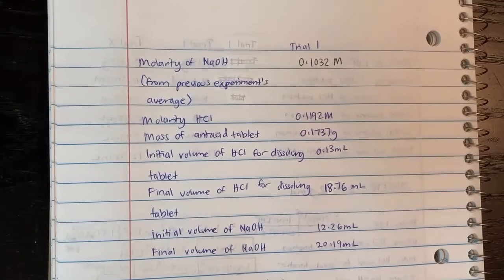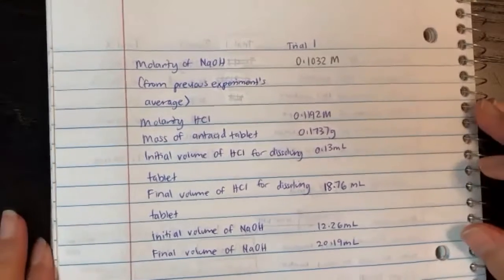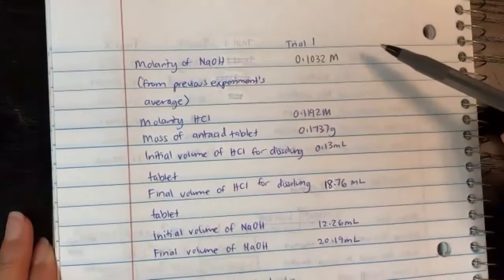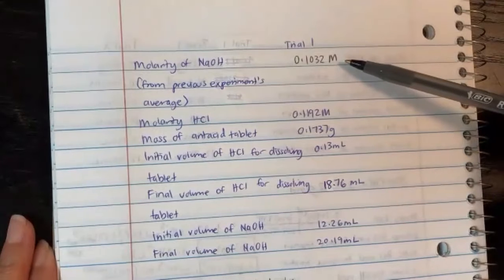We're going to learn how to calculate titration 2 experiment data, which is for determination of mass percent of antacid. Okay, so first things first, you will need the average molarity of sodium hydroxide from the previous experiment.